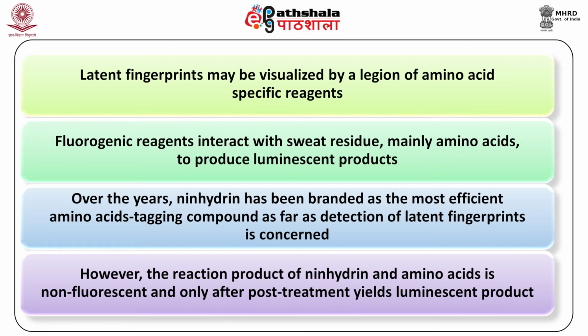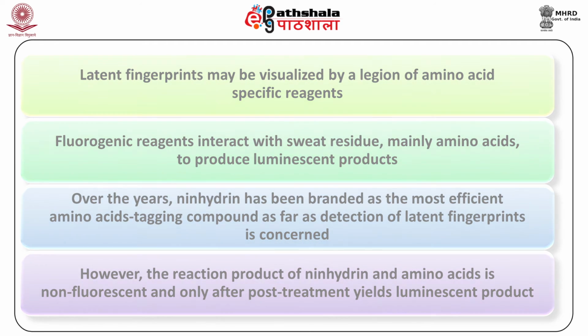Over the years, ninhydrin has been branded as the most efficient amino acid tagging compound as far as detection of latent fingerprints is concerned. However, the reaction product of ninhydrin and amino acids is non-fluorescent and only after post-treatment yields a luminescent product.